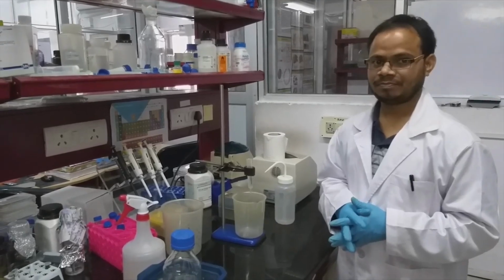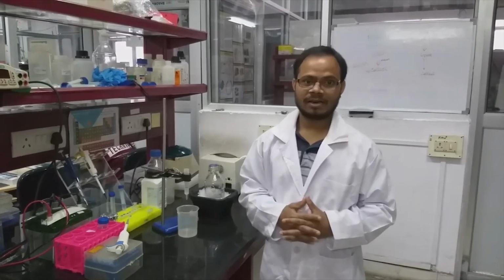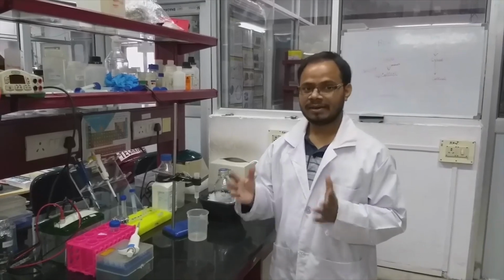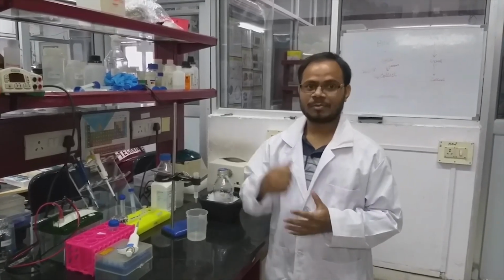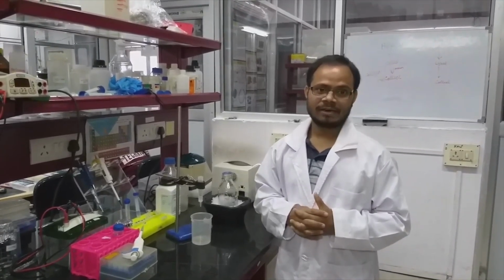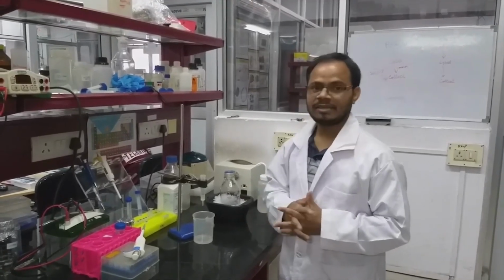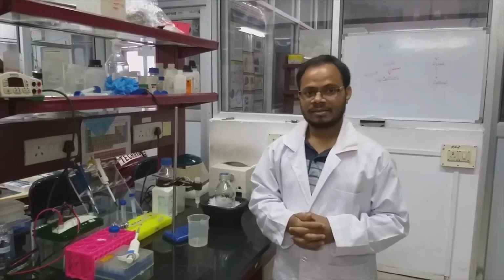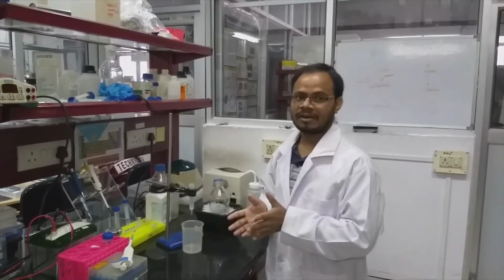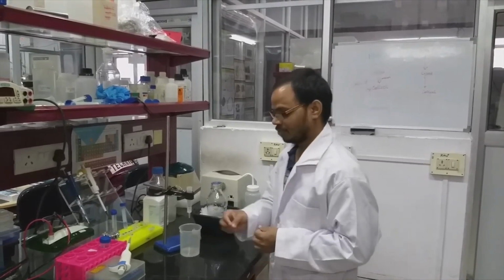Before equilibration of the column, we have to charge the column. For nickel NTA, there are 2 types of beads. One is readily charged beads which come from the company, and for the other, we have to charge them ourselves. They will give only NTA agarose beads. So here we will charge the beads with nickel and then equilibrate. We already washed the column with water and 0.2 normal NaOH, and again with water. So now we will equilibrate.